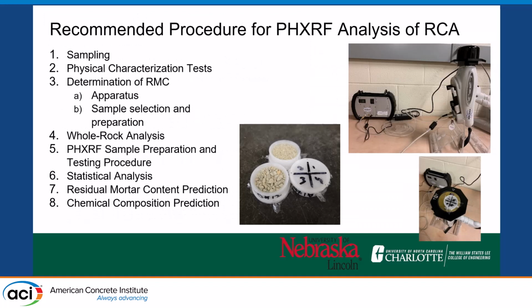And so after that, we took our procedure and wrote up a recommended procedure so that someone else could replicate our work. We see it as if you're commonly seeing RCA coming into your jobs. I see Eric there from Colorado. I need to talk to you. You've got lots of RCA coming in. Creating a reference database and then following this approach, you'd create your own prediction equations based on what you're seeing.